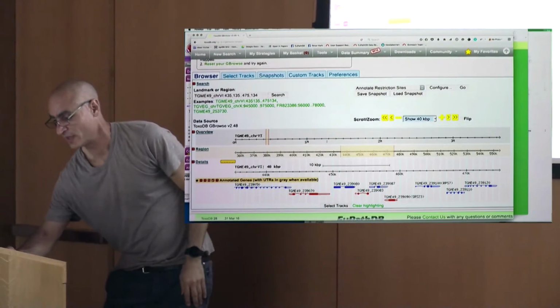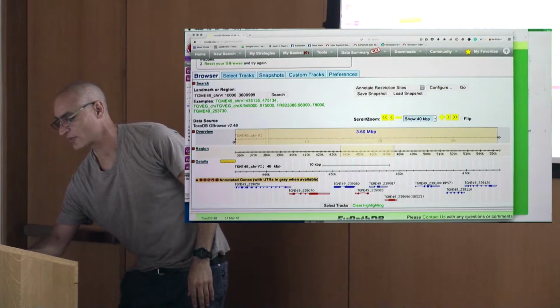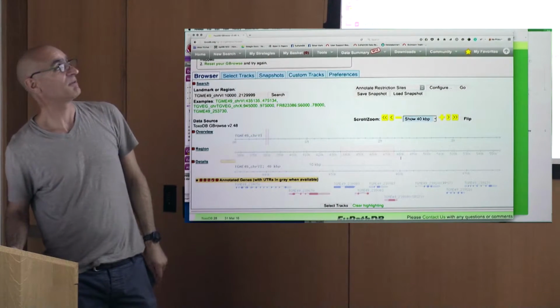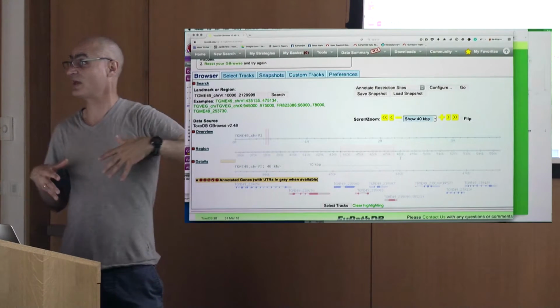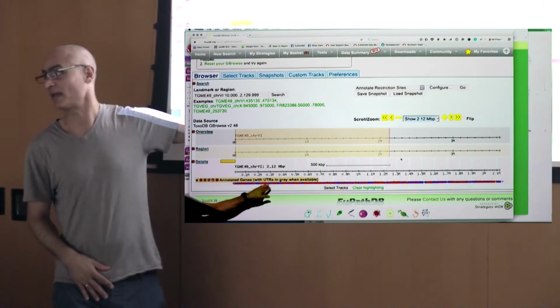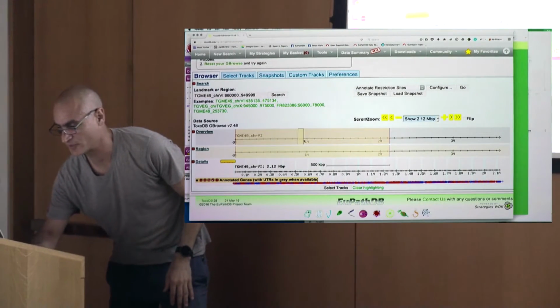If we zoom out, I can click and drag across chromosome 6. Well, let's make it a little less, because the more data you try to load, the longer it takes. But basically, if you zoom out to a bigger portion of a chromosome, you're going to see many more genes displayed in that portion of the chromosome. You can barely see anything, it's just genes everywhere. So let's go back and zoom into another location.